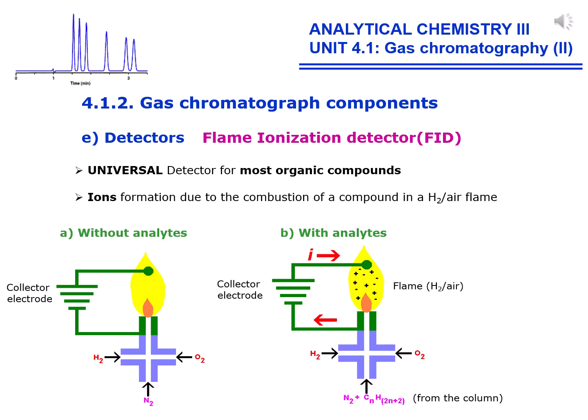Flame ionization detector, FID. It's generally employed for organic compounds since it's highly sensitive to C-H bonds, so we can say it's a real universal detector. The gaseous stream leaving the column enters the flame of a small burner fed by a mixture of hydrogen and air, where the compounds are pyrolyzed, forming ions and charged particles which create an electric current.